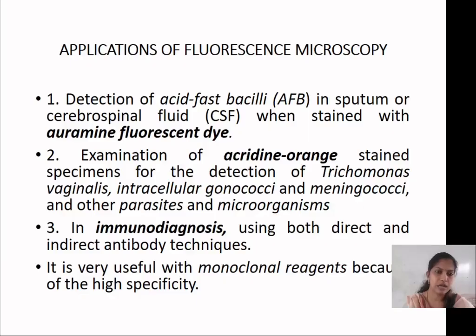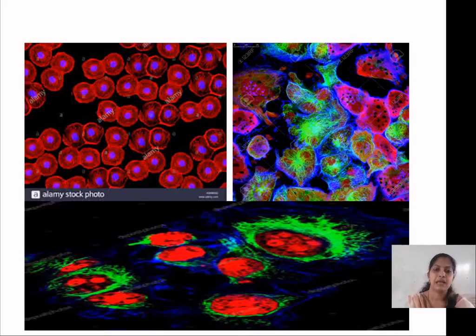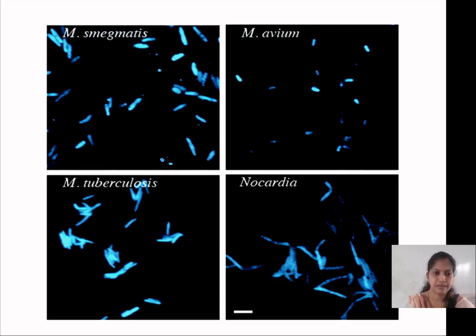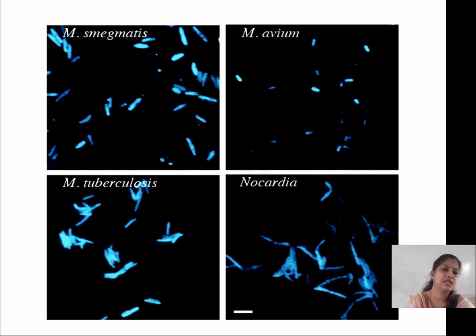So this is how we use a fluorescence microscope. When we remove the filters, the fluorescence color will come. This is our fluorescence microscope. Thank you.